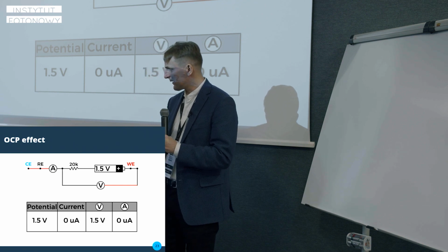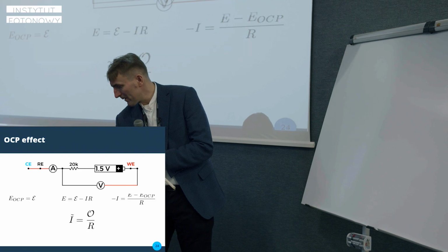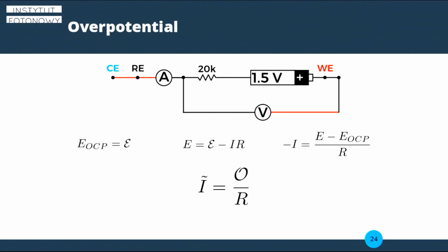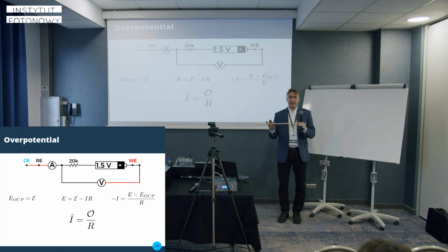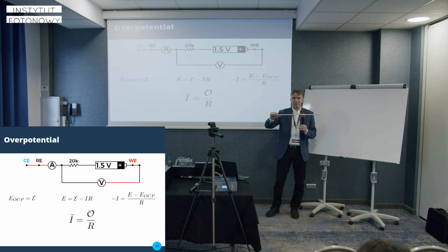And our software helps with that. We will show it in a second. You may want to set up, before you start your experiment, you may want to measure OCP and start measuring all the potentials set on the potentiostat from that value.